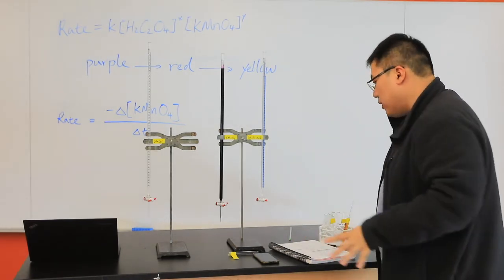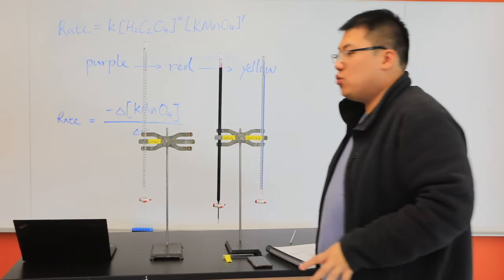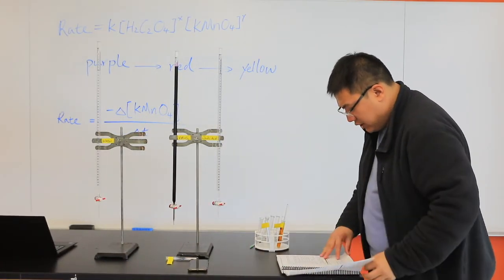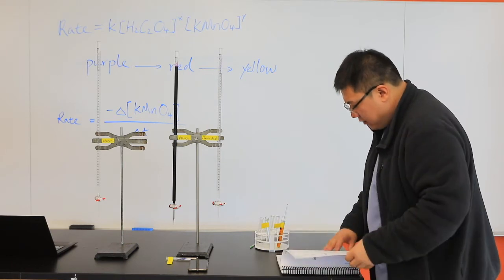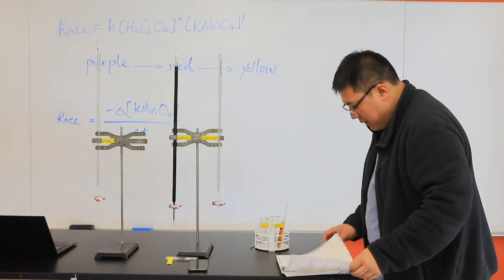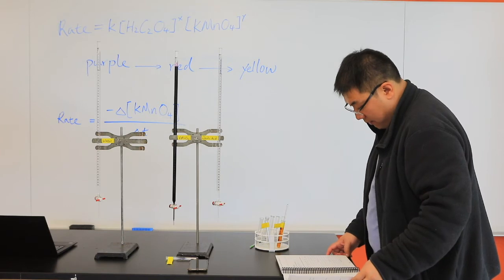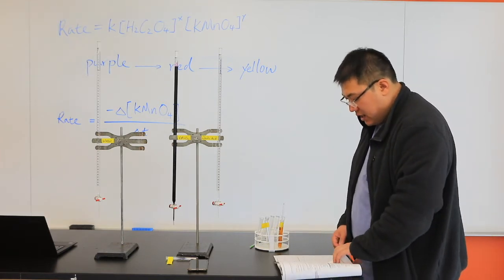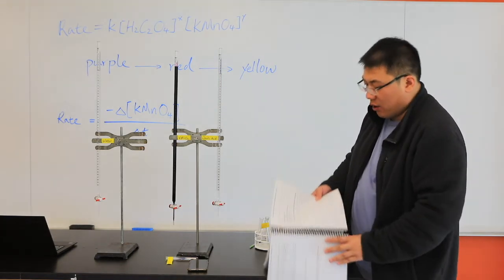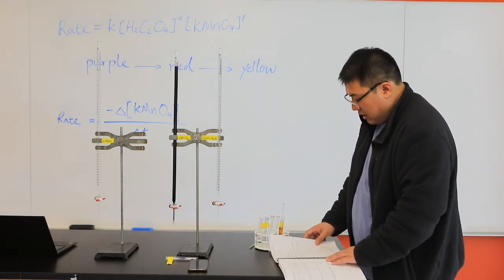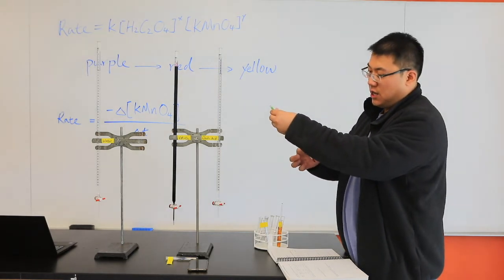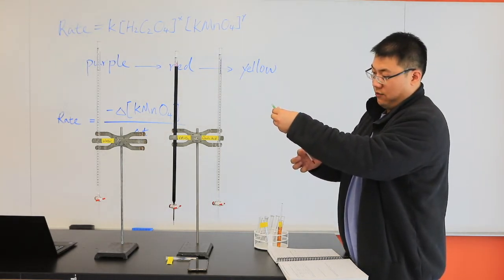So, according to the procedure, we're going to repeat this with different concentration. And for each of these, we need to repeat it 4 times. We're going to take an average of the elapsed time for each determination. So, these are right at the room temperature. Currently, the room temperature is 23 degrees.